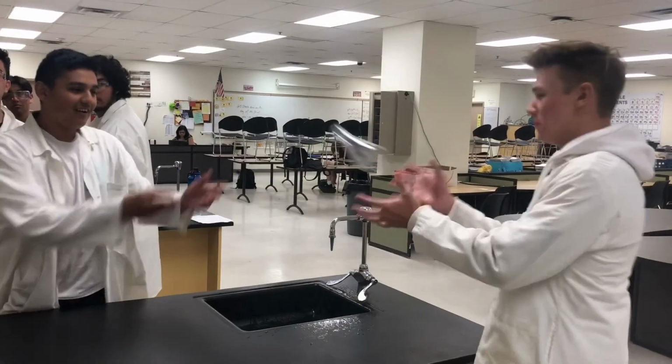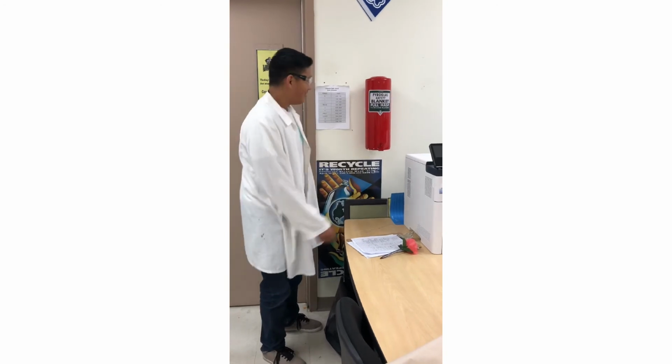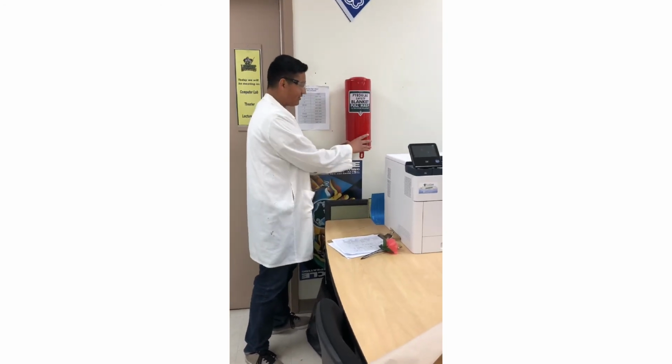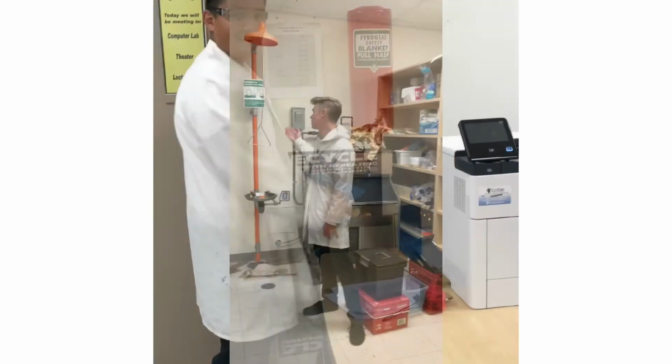That was too slow. Wait. What is wrong? So if you find yourself on fire, this is the fire blanket. To get it out, you just flip this. Eyewash station.